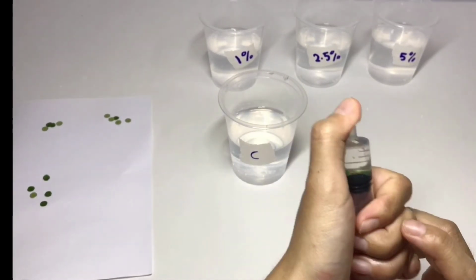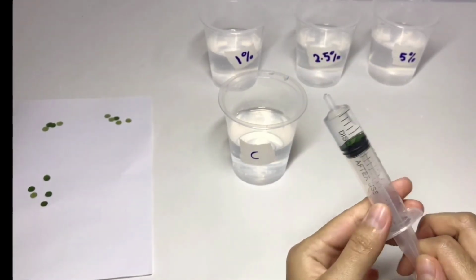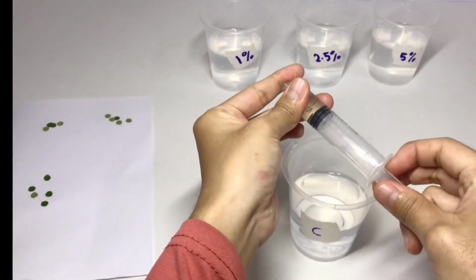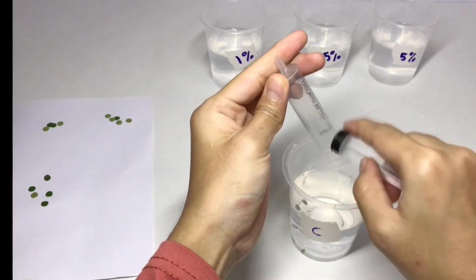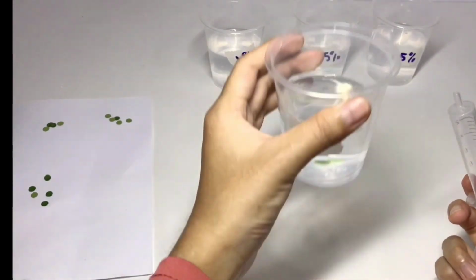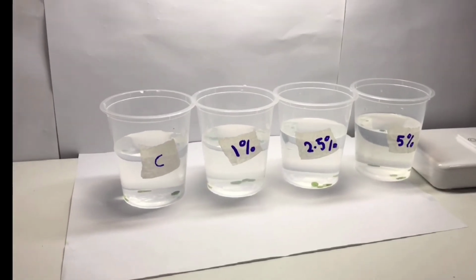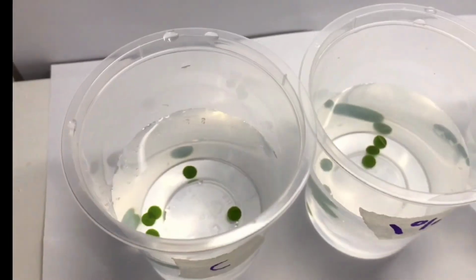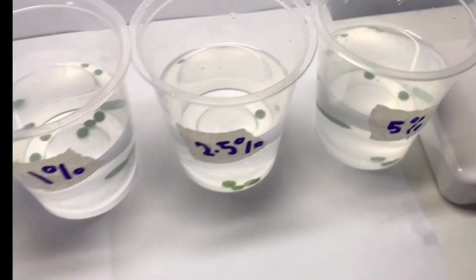All syringes containing the small punched leaves and water are transferred to beakers containing sodium bicarbonate at different concentrations and also to the beaker that contains water solution only. The beakers will then be placed under a table lamp at a distance of approximately 30 centimeters. Observe when the leaves start to float and record the number of floating leaves at the given time intervals.